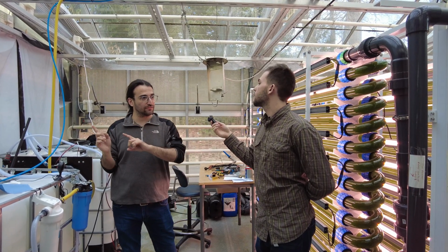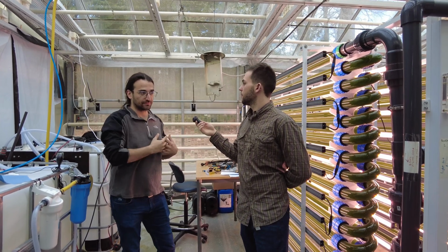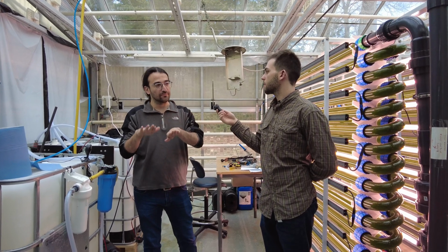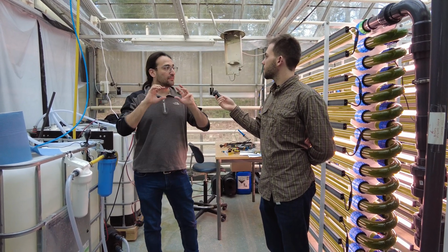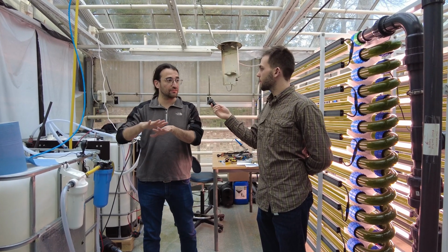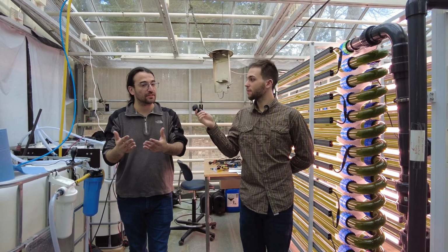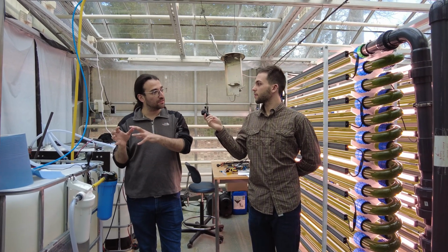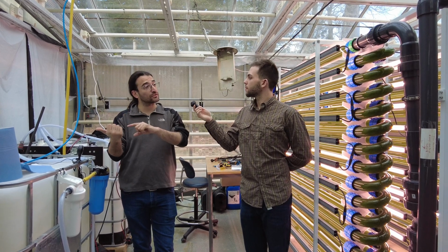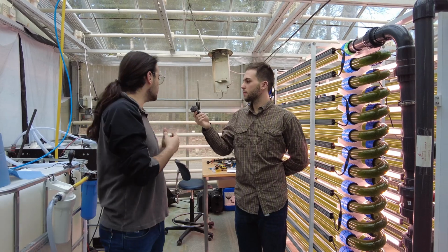And also in that method, we are controlling how much nutrients we are giving to the system, because we know how much our algae are consuming the nutrients. So we are balancing it and making sure we are doing successful wastewater management. We are keeping the concentration level below the regulation level, so we can discharge at the end, but we don't want to discharge it. We want to keep it and maybe send it back to the greenhouses again. So greenhouses can use a similar water, so they don't need to use any additional fresh water, plus the nutrients.